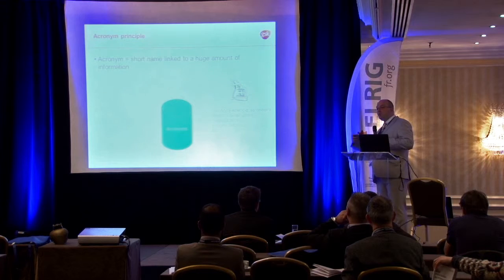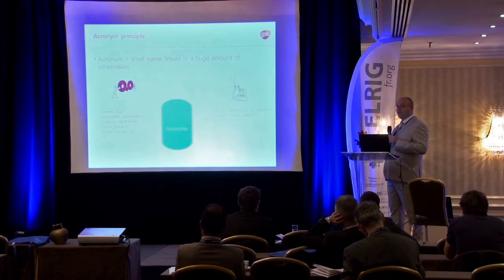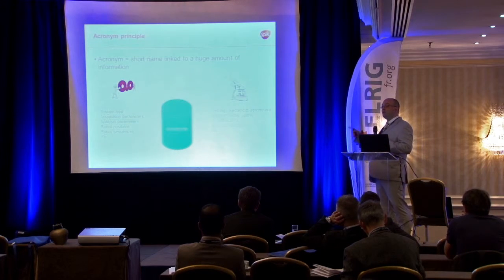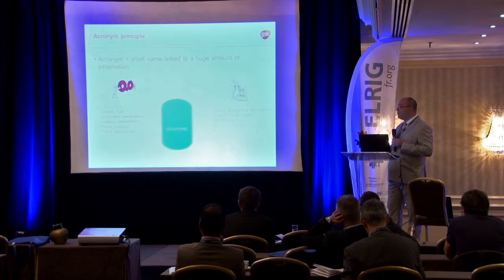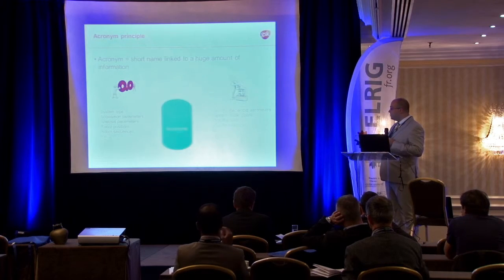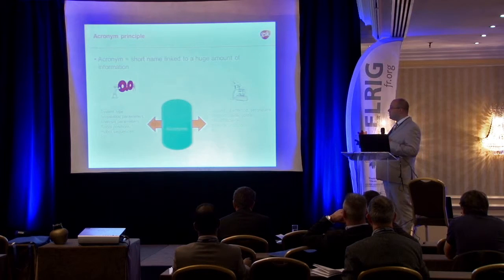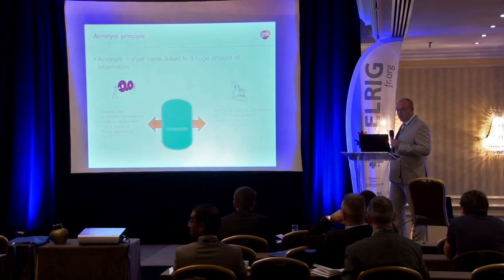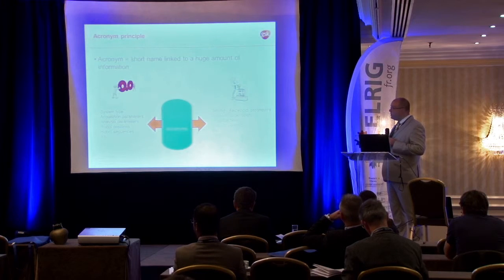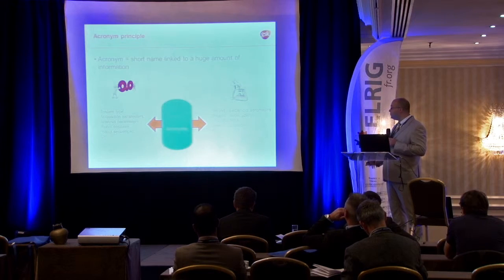But for the automation side, there is also a lot of information. What kind of system do I have to use? What are the acquisition parameters I have to use for this test? What are the analysis parameters, the robot position, and so on. So a lot of technical information for the automation part. And when we talk together, we can use the same acronyms, and everybody can understand each other. That's really one of the keys, and we have used it now for several years, and everybody always talks with acronyms when we talk about a test on a system.